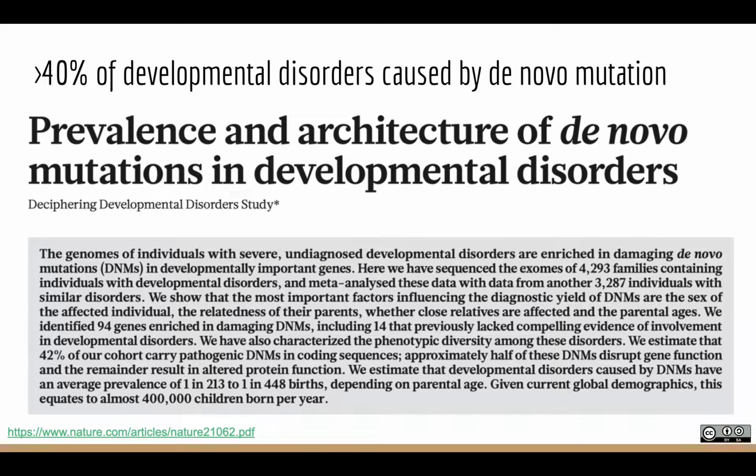Right. So we've exome sequenced these 3 individuals. Now, if you exome sequence mom, dad, and a kid, you typically get about 25,000 genetic variants that overlap coding sequence in a VCF file. So if our hypothesis is that it's a de novo mutation that is causing this developmental disorder that we're studying, we're essentially trying to figure out which one of the genetic variants in that VCF file underlies the phenotype out of the 25,000, right? So it's a bit of a needle in the haystack problem.